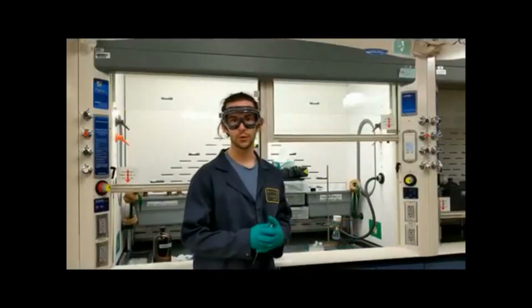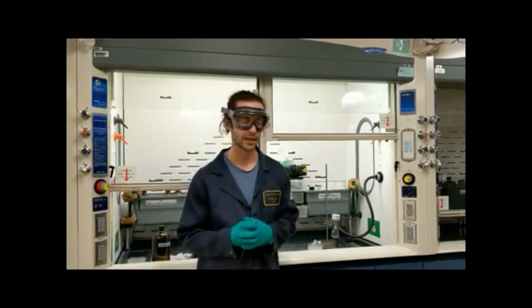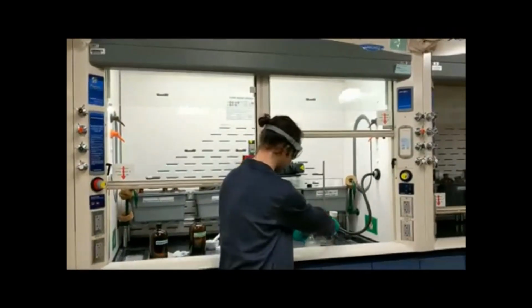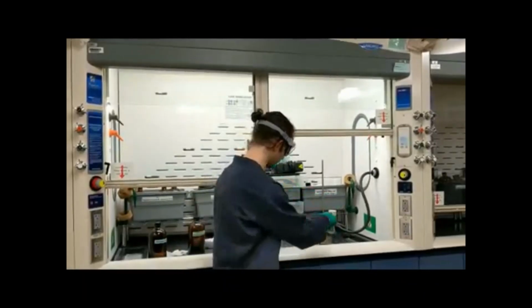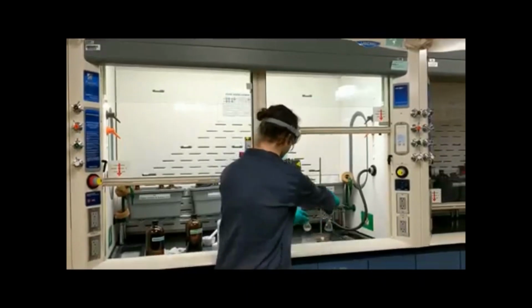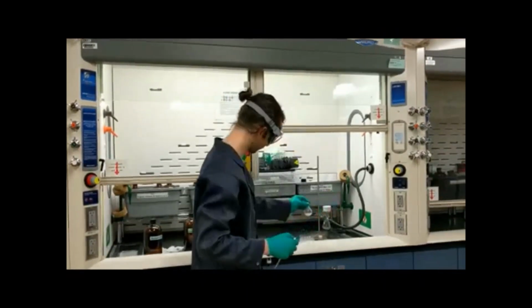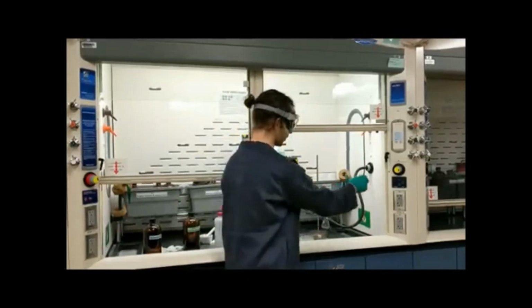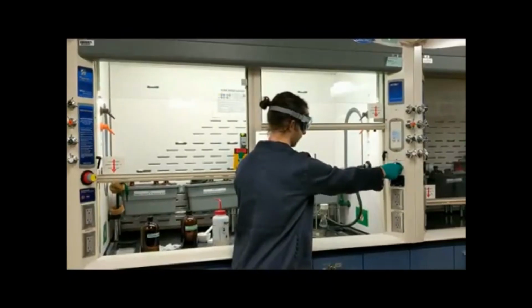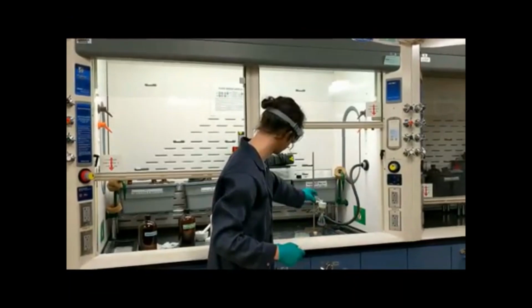At this point, we let the reaction cool on the ice for about 15 minutes, and so we're going to filter off our product in order to isolate it. In order to do this, we've set up some cold ethanol in order to rinse our solution, and we have set up a Buchner funnel with a rubber connector and a piece of filter paper inside the funnel. This will allow us to isolate our crystals. So what we're going to do is turn on the vacuum and pour our solution over the Buchner funnel.